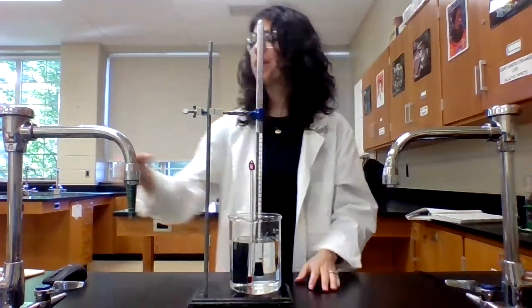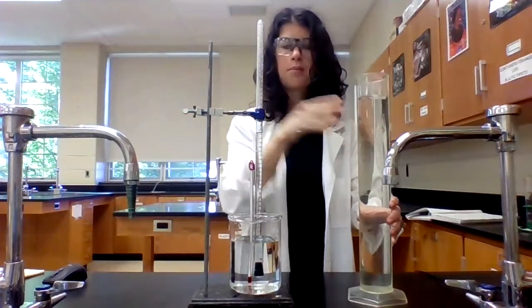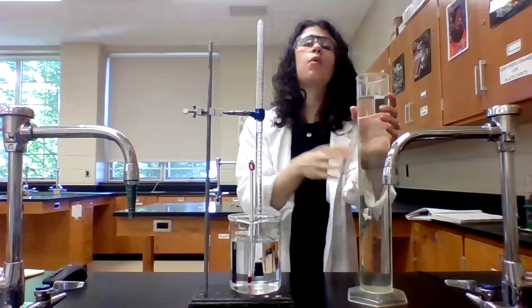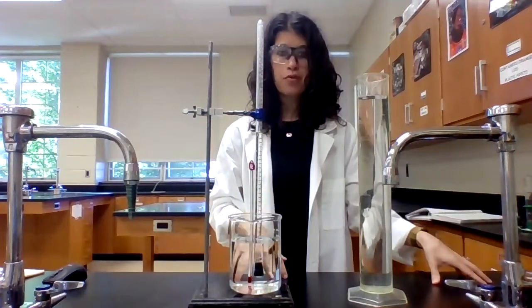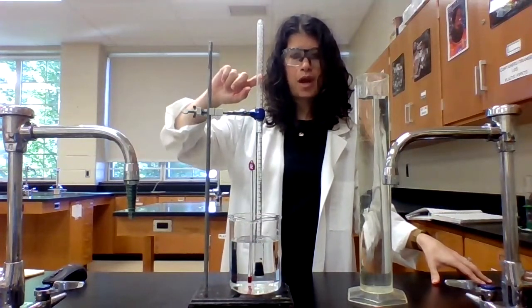Now, I said approximately 26 milliliters of hydrogen gas. I do need to record a precise volume of the hydrogen gas, but I'm not going to do it right here. What I'm going to do is transfer my eudiometer into this graduated cylinder. So why am I going to do this? I measured the pressure of the room. I can't put my barometer inside the eudiometer to measure the pressure of the gas.